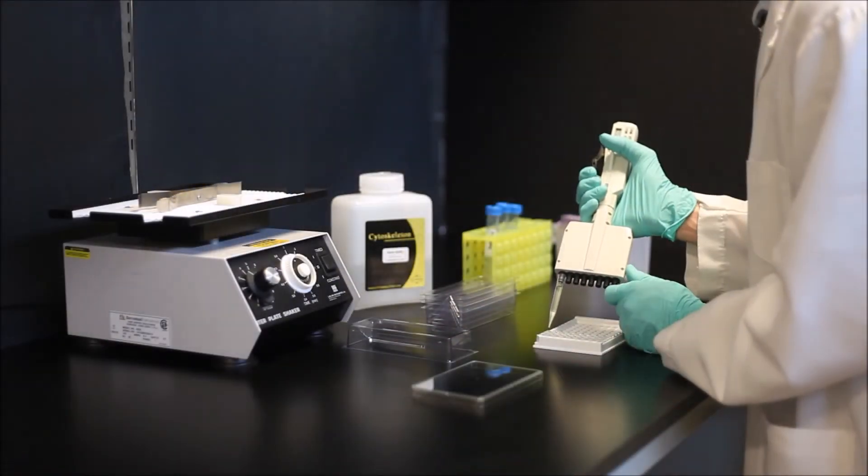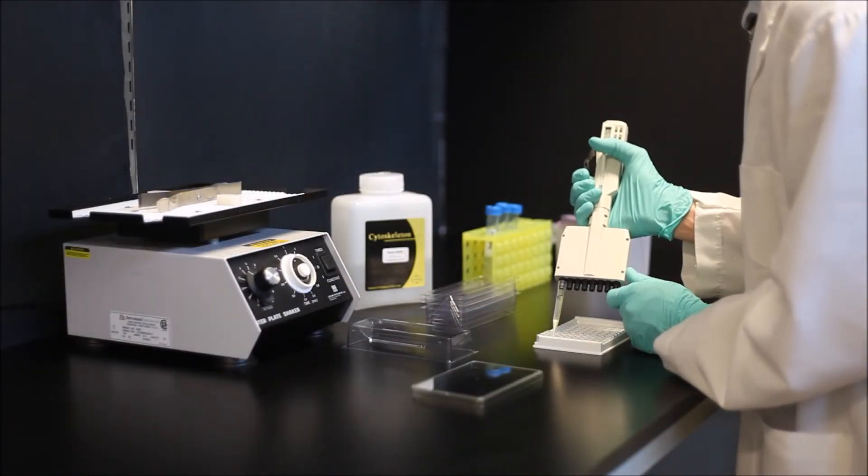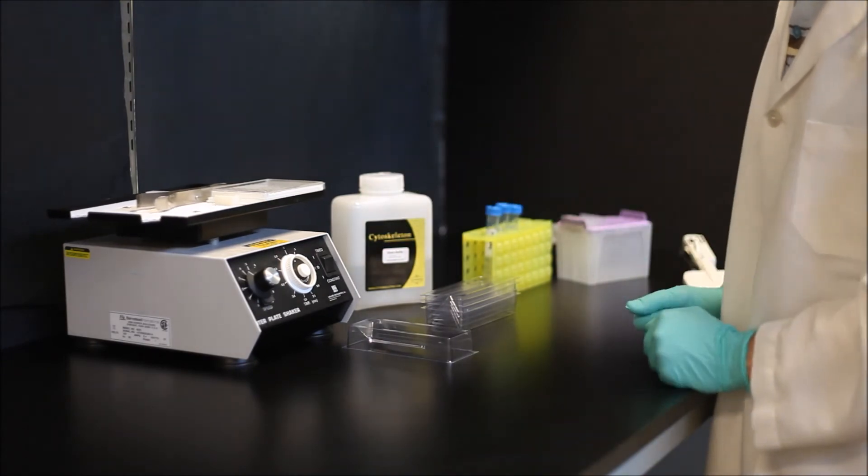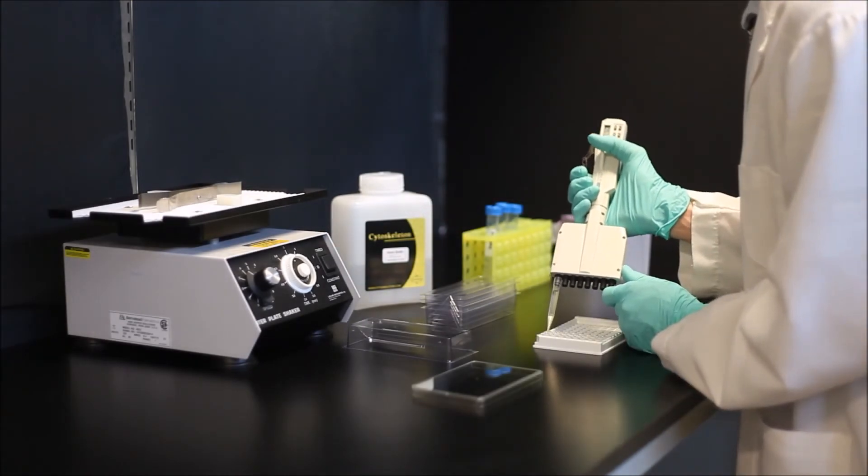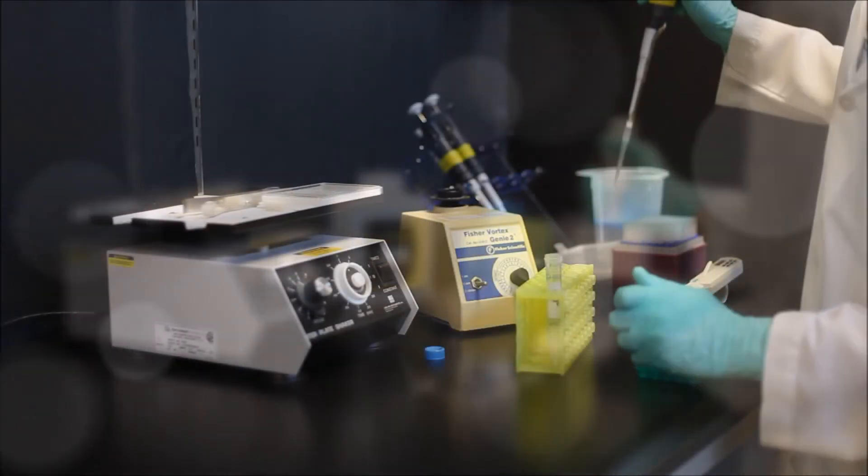Now add diluted primary antibody and incubate for 45 minutes on a room temperature plate shaker. This is followed by three more washes with room temperature wash buffer, followed by addition of an HRP conjugated secondary antibody. Consult the manual for antibody dilutions.